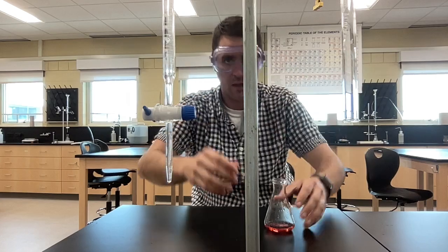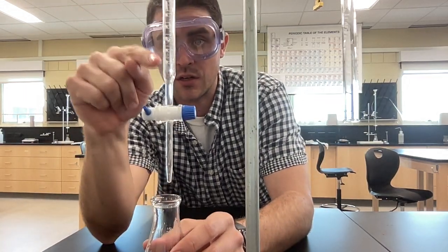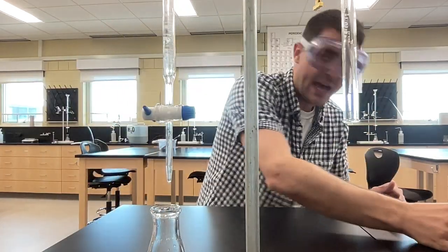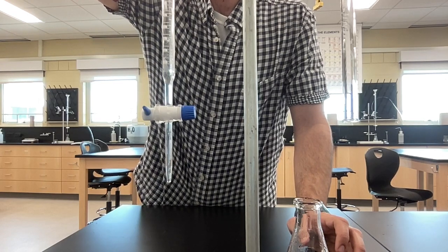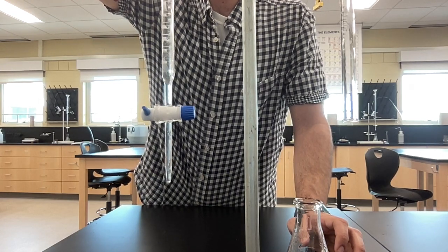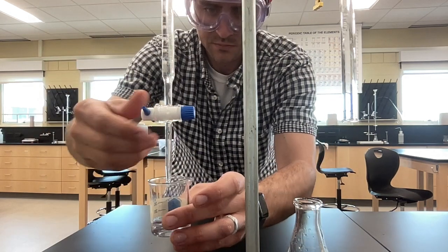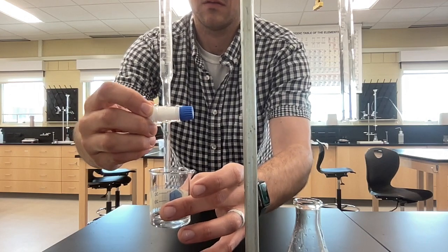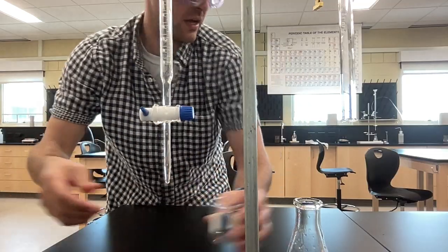Let's see. I started at 10 milliliters here. It goes to 25. I might need to fill this thing back up a little bit. I might need to add some more back to my burette just to make sure we have enough to get this thing done. And there we go. Okay, so now I've got 25 milliliters here.